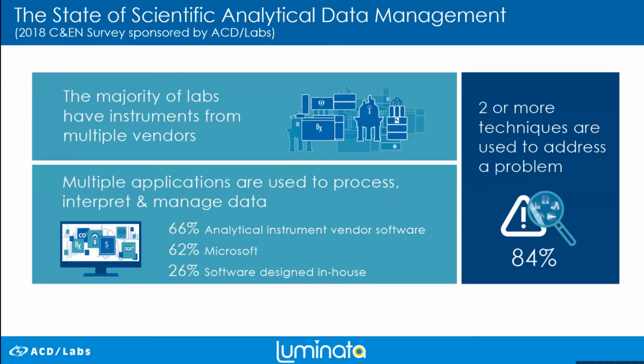So several years back, we gave a survey, and the survey was really outlined to discuss, for the majority of labs, how many instruments are being used, and really, at that point, what are you using to process, interpret, and manage? What we found for a majority of the people that took the survey was that they were using the vendor software. If they weren't using the vendor software, they were using Microsoft, such as Excel or Word, and then maybe placing that into SharePoint. But at the same time, they may have something in-house.